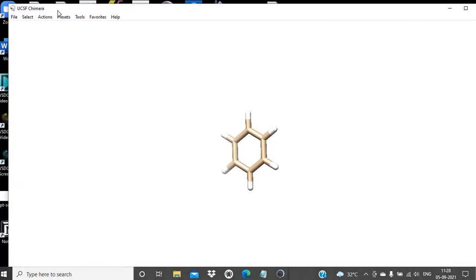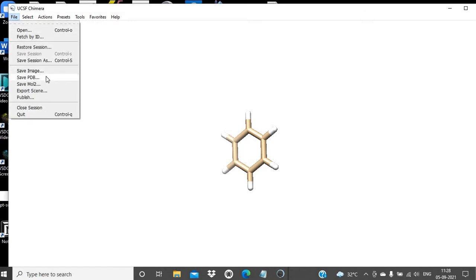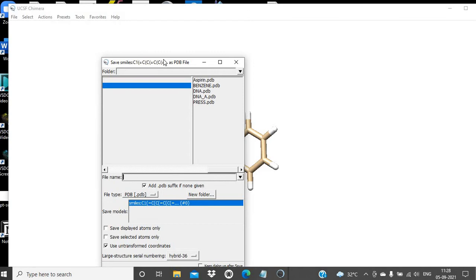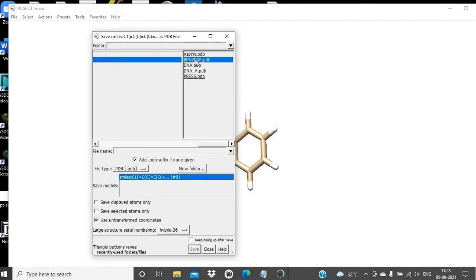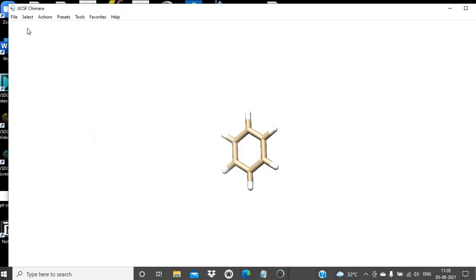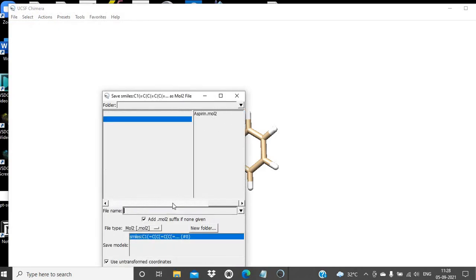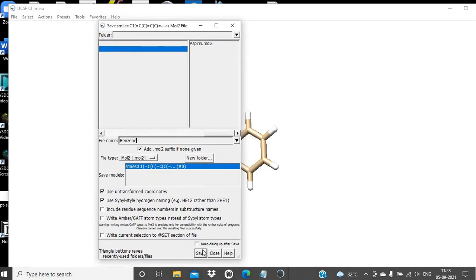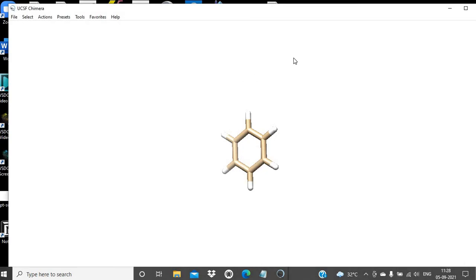If you want to save this structure, then simply go to File, then Save PDB, and you can save it as benzene.pdb — you just have to write benzene and the .pdb extension will be automatically added. You can also save it as MOL2 using Save MOL2 — again just type benzene and the .mol2 extension will be automatically added. So now in that folder we have benzene.pdb and benzene.mol2.